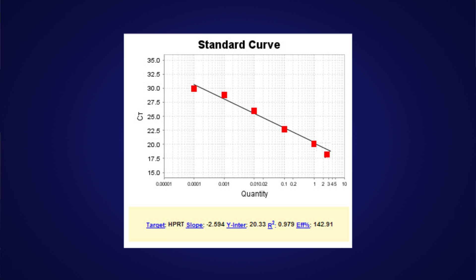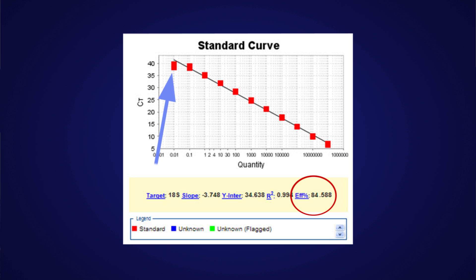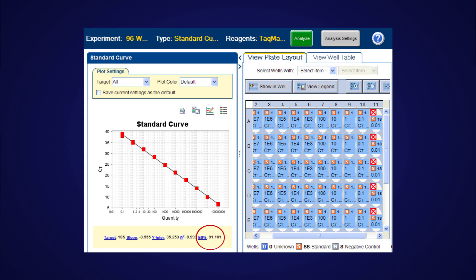Let's check some other data for outliers. If the standard curve looks good except the point representing the most concentrated sample occurs at a later CT value than expected, then it is likely that this dilution point is showing inhibition — let's omit the point and reanalyze. We can also see outliers on the opposite end of the curve from our most dilute samples. These high CT outliers are generally the result of a low-copy reaction, ordinarily seen at CT values above 35 cycles, and can constitute the limit of detection for your assay. If you have one of these points, you can omit and update the data.